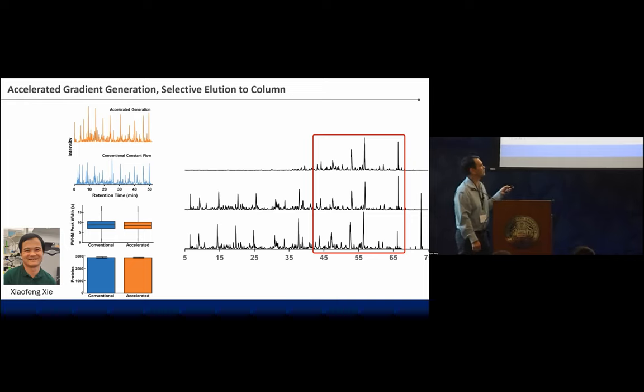But he is like, no, I'm just going to make it so as soon as a run comes off the mass spec, it gets automatically searched, it gets automatically processed. And so I'm just going to take all the human stuff out from data generated to data analyzed. And so this has been really awesome for our group, and it's made to be a collaborative project. It's open source. It's already on GitHub, and Xiaofeng will have a poster on this at ASMS. So I hope you're interested, because it can basically be trained to do anything.